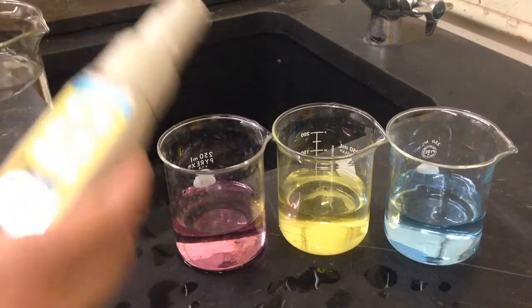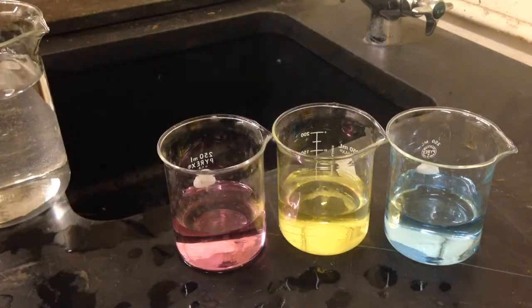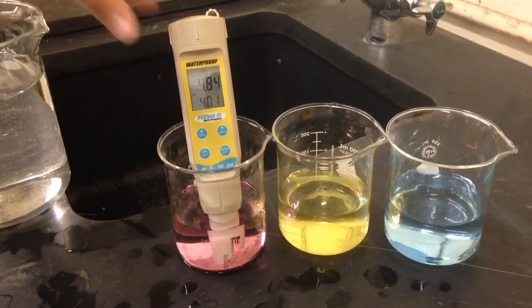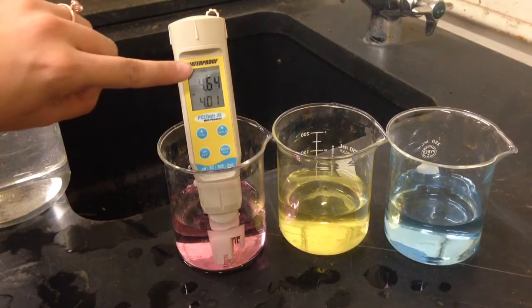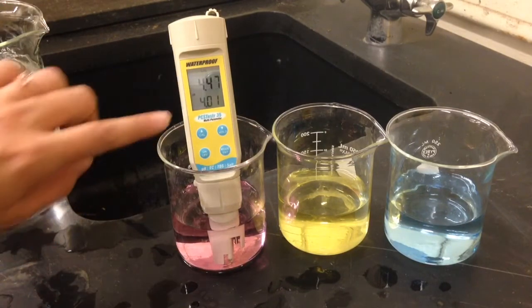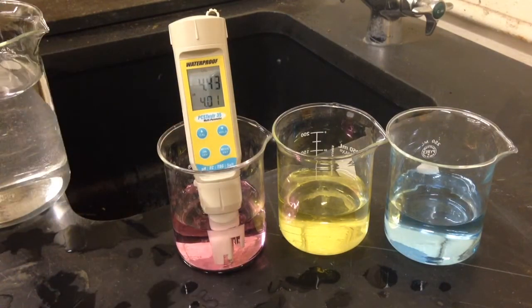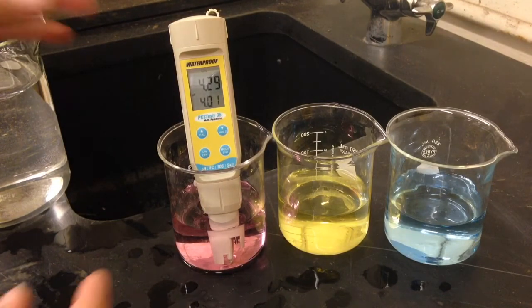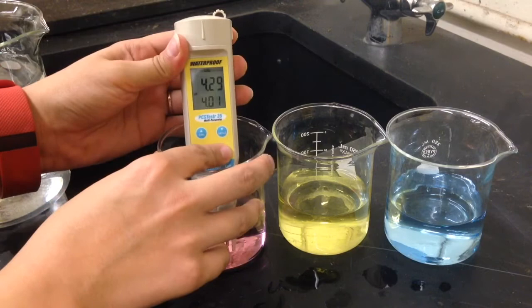We can use either the acidic or the basic solution next, so we will choose one and immerse our meter. The primary display is going to read the actual value of the container, and the secondary display will read the closest pH calibration standard. We are going to wait for the primary display to stabilize, then push the mode enter button.